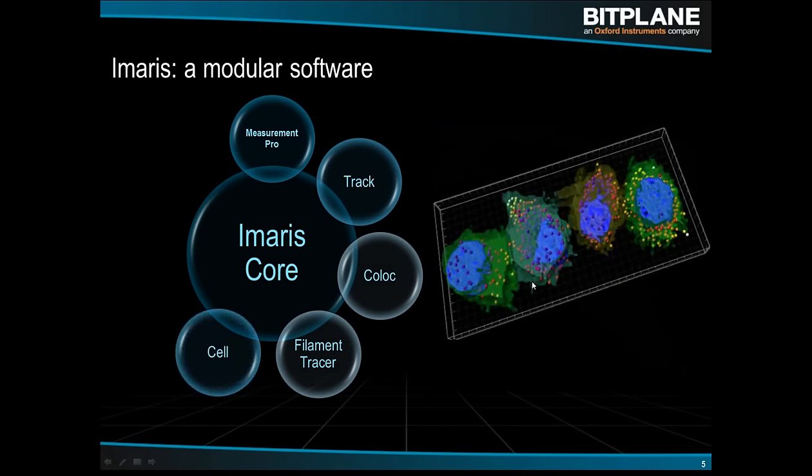In Imaris Cell, you have the only case of one of the segmentation tools that is a multi-component segmentation. So in this screenshot here, you see that there are some cells detected, and those cells have nuclei, and within those cells are some other subcellular components. The software refers to them as vesicles, but they could be anything point-like or blob-like within the cell that you would label their position with these spheres.